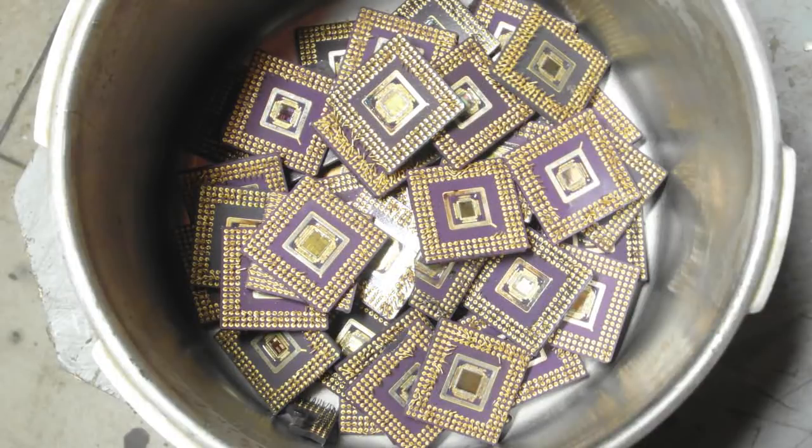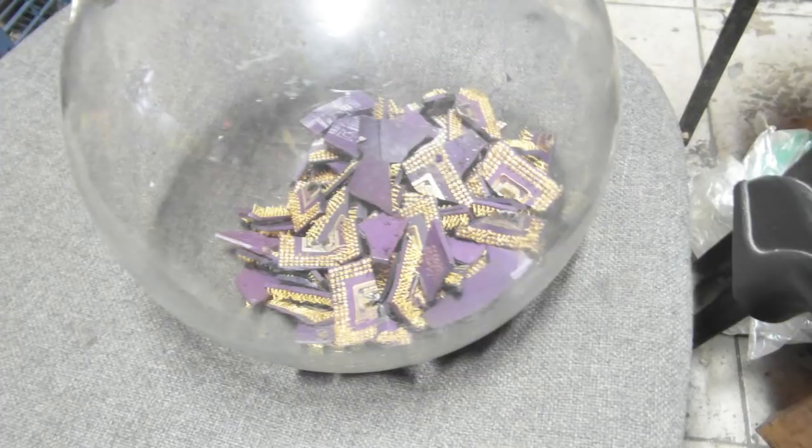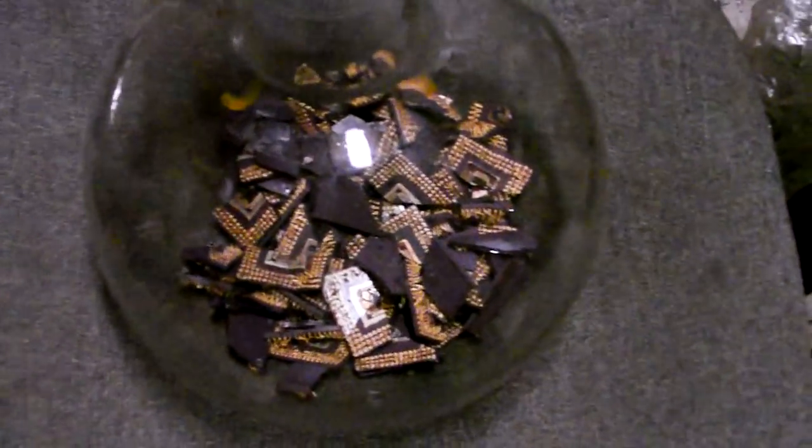The ceramic CPUs were broken to pieces and treated with aqua regia. SMB was added to the solution.